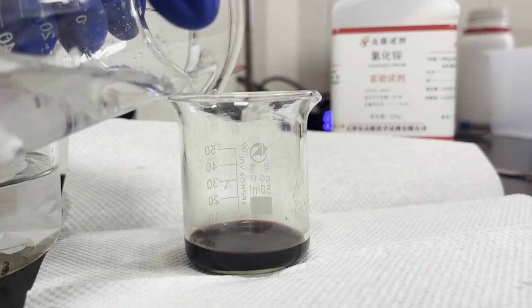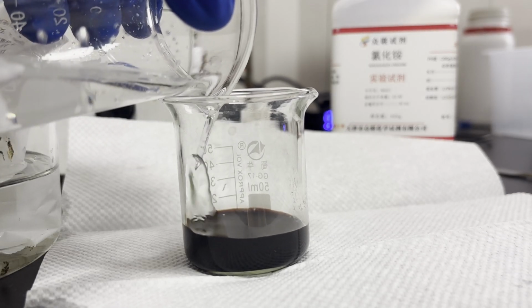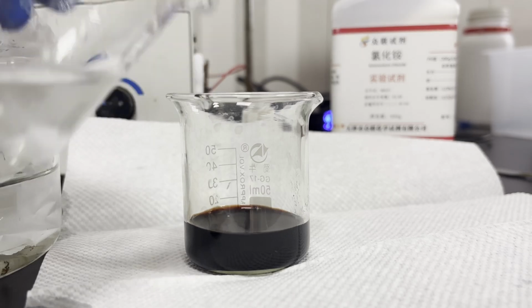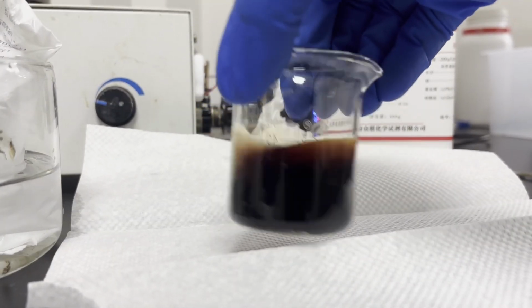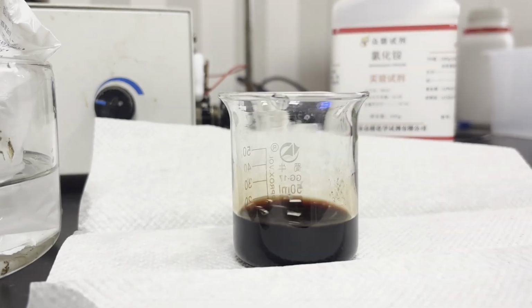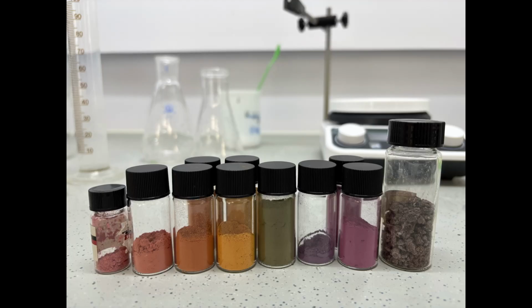I then tried taking a small sample of the resulting solution and adding a concentrated ammonium chloride solution, but no product precipitated. I thought I'd screwed everything up with the bad temperature control, so I left the beaker on my lab bench for a few weeks, and it surprisingly crystallized. Although definitely very impure, the crystals show a dark red color consistent with the literature, and that's all I need.